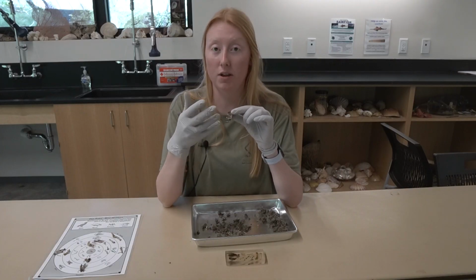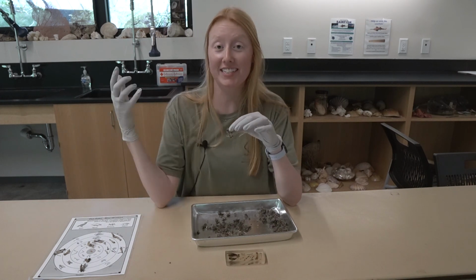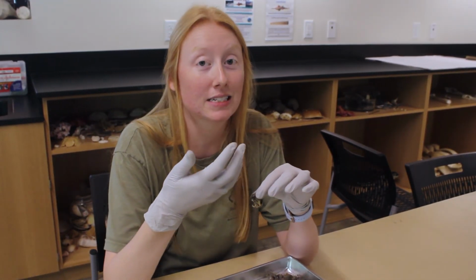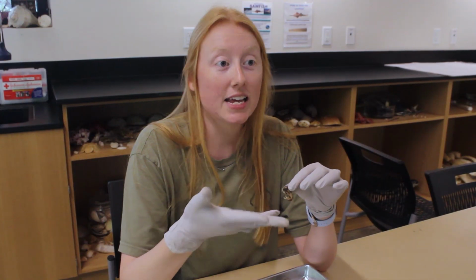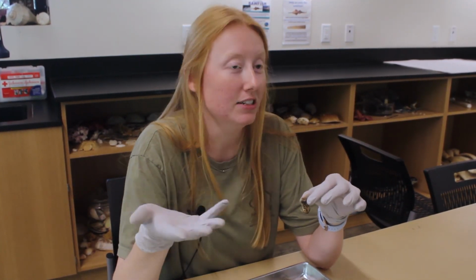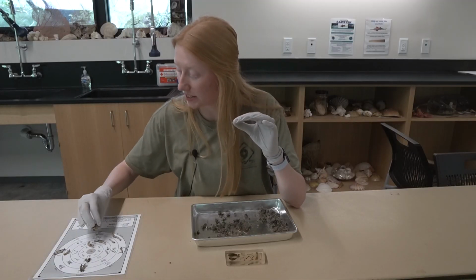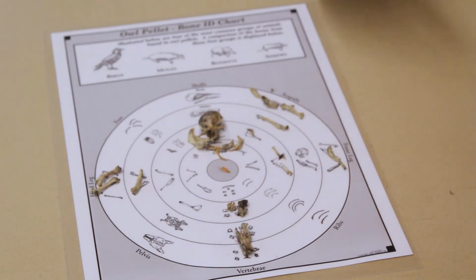I did not put all of the bones from the pellet onto the map because it's a bunch of very, very tiny little fragments of bones, and obviously bones are going to get broken because it's something being eaten. It's going to be hard to ID, but always have fun and try to ID and think of whatever it came from, whether it be a rodent or a bird, or maybe even a lizard. You never know what owls like to eat. So we'll put this guy with the rodent skull section, and move over all these jaws.